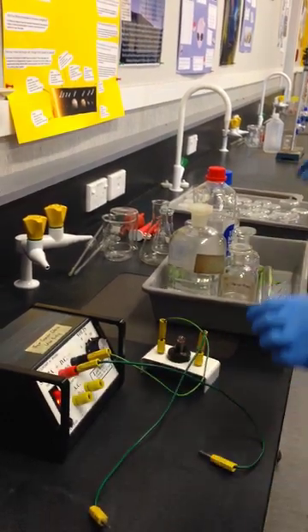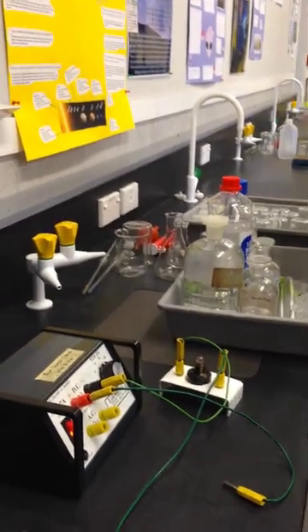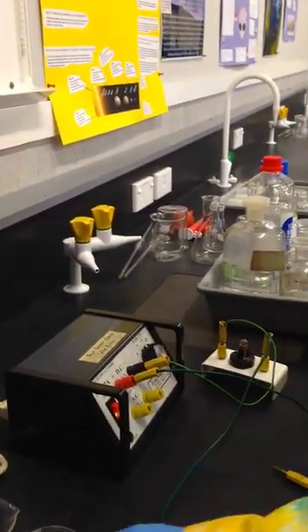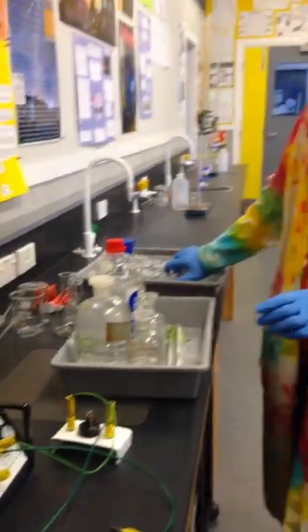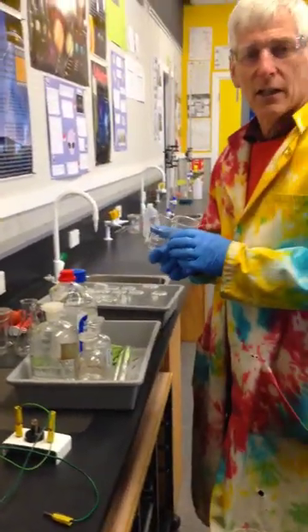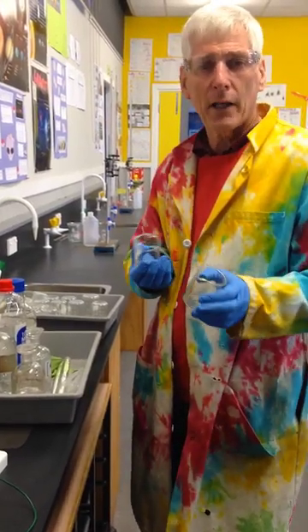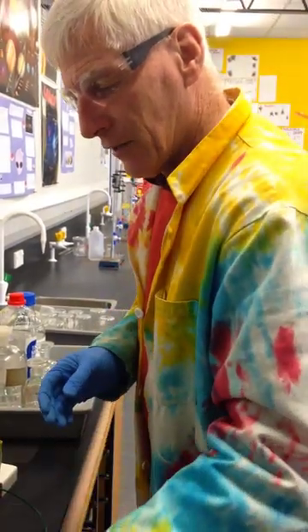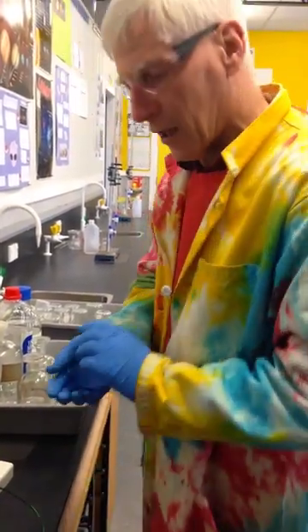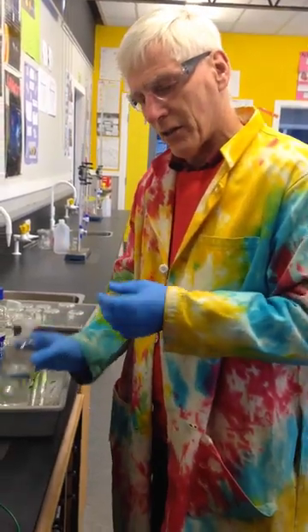So the question you should be asking yourself even now, before I do each one of these tests, is would any molecule or any molecular substance conduct electricity? And why? If so, why? If not, why? Remembering, for an electric current you need free electrons or ions. So think about that as I do these demonstrations.